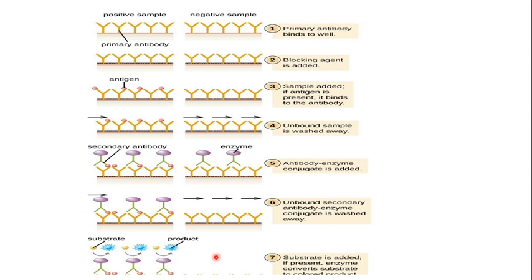What I mean by positive and negative over here is that if we say that our sample is positive, that means our antigen of interest is present in the sample. And if we say that our sample is negative, that means our antigen of interest is not present in the sample. Therefore, you are not getting any kind of result.